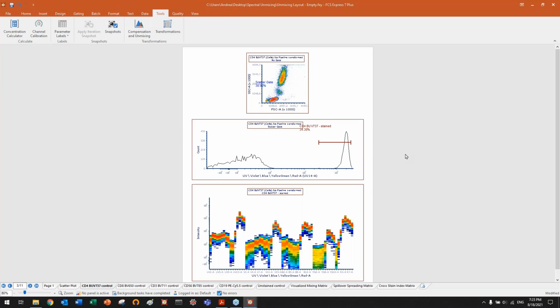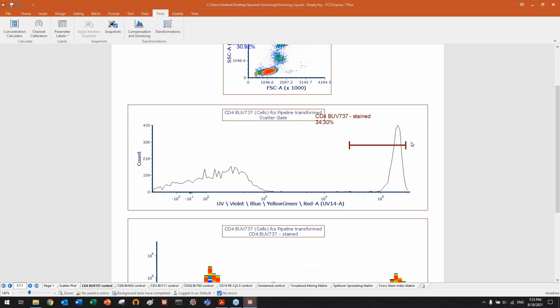In this case, you only have one marker, because we are using an external negative, not self as negative, so the negative population will be defined in this page. If you do not select the universal negative, the external negative, and you set the CD4 to use self as negative, then you will have two markers here, one for the negative, one for the positive.